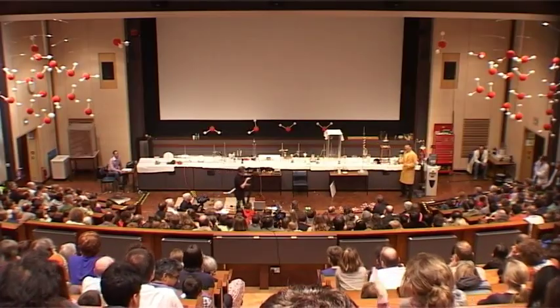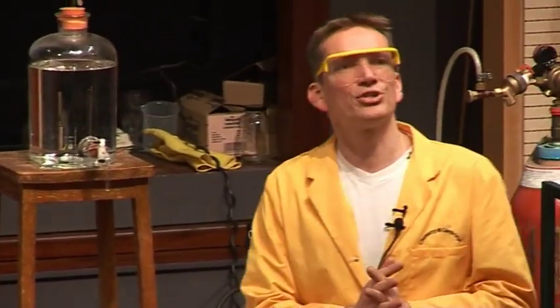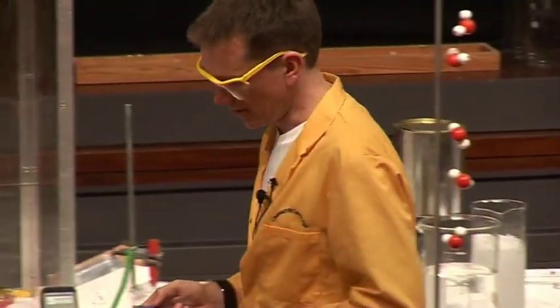So what was happening there, the static electricity in the charged rod could deflect the stream of water, but this could only happen because of the unsymmetrical distribution of the charge around each water molecule. More negative charge on the oxygens, more positive charge over the hydrogens. And it's these that give rise to the hydrogen bonding.